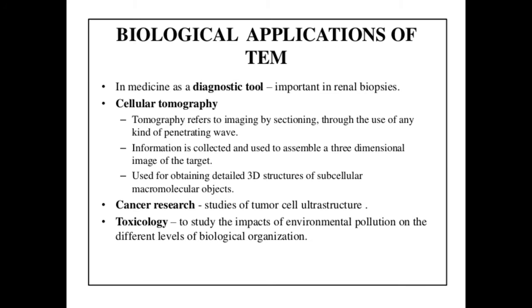Dear students, today we have learnt about the principal parts and cross-sectional view and working, advantages and disadvantages and biological applications of a TEM.